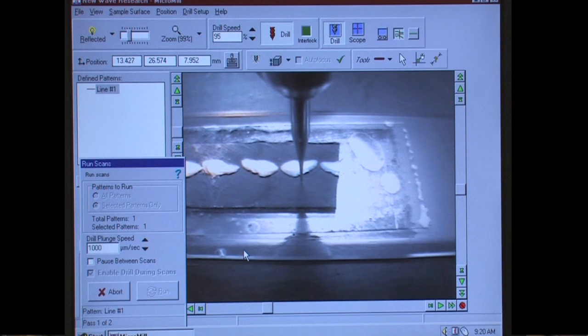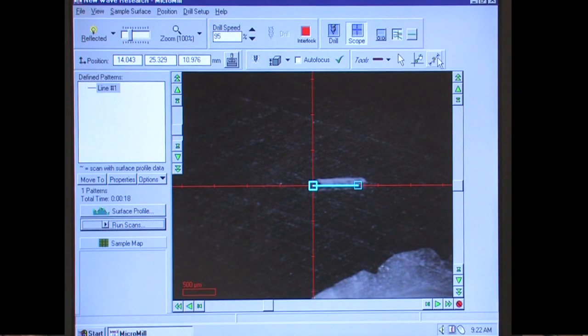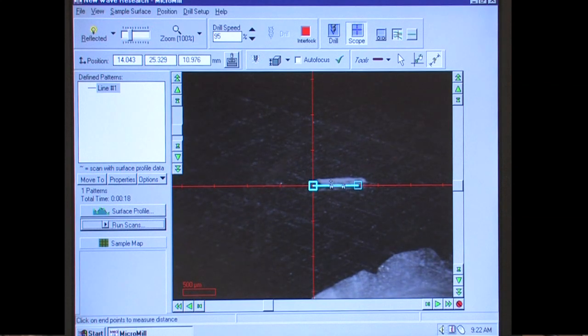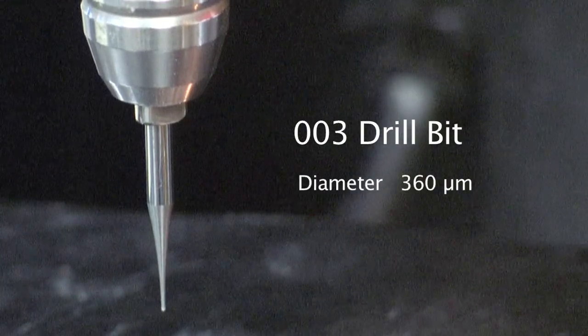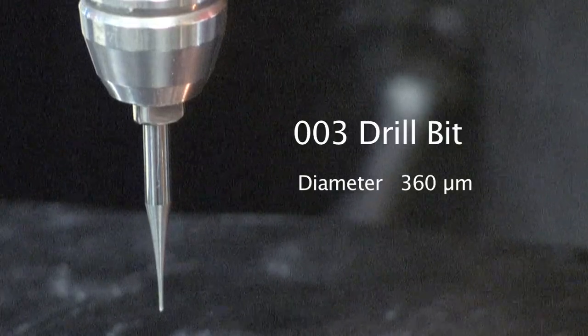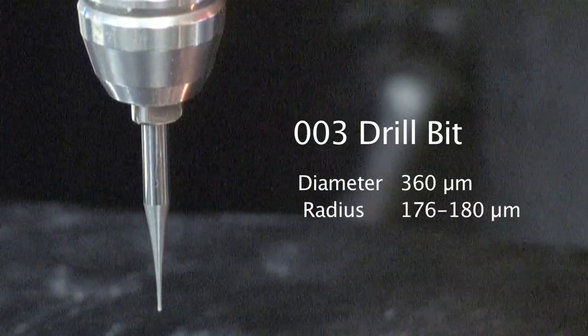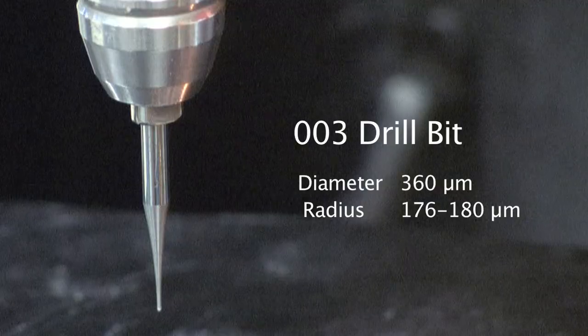Using the line tool, drill a short line in the resin away from your sample, and then use the measuring tool to determine the width of the drill bit. The 003 burr drill bit has a width or diameter of about 360 microns and a radius of 176 to 180 microns. Other bits will have different thicknesses.